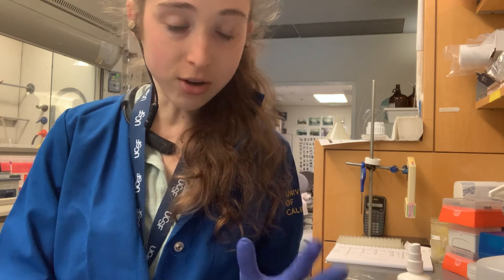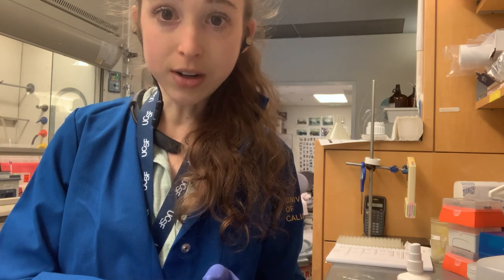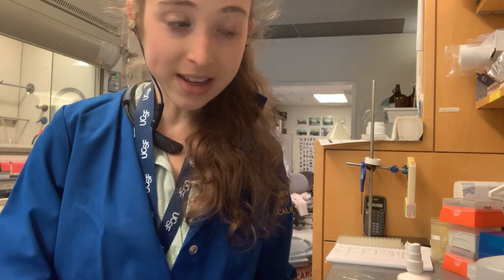But what about those tubes that you're just going to use right away? Sometimes you think you're going to use something immediately and then you get distracted — maybe your boss calls you in for a meeting — and you come back and don't know what's what. So you always, always, always need to label your tubes, your beakers, your everything, even if you think you'll use it right away.